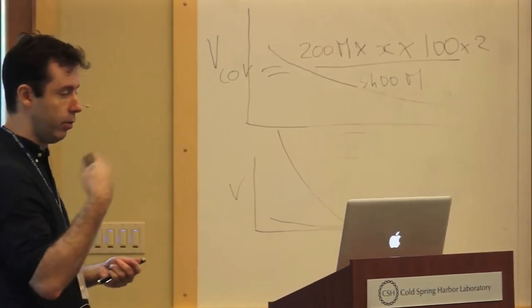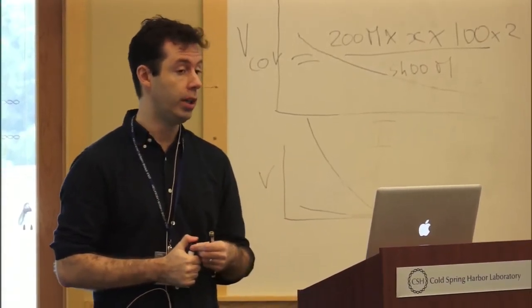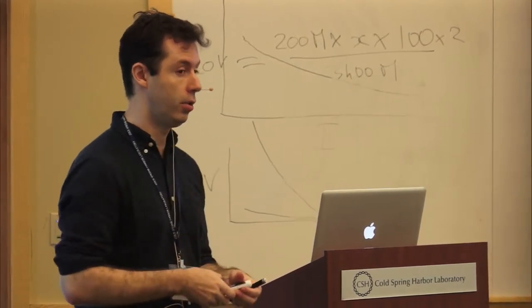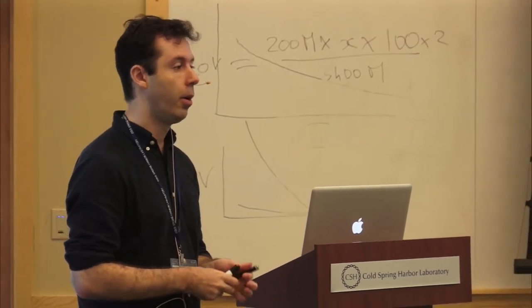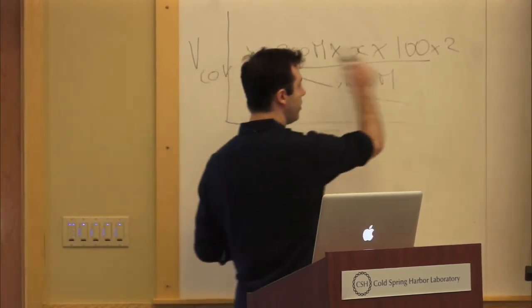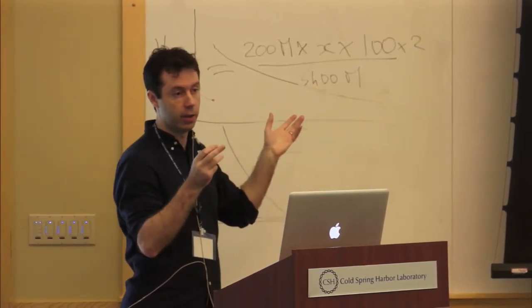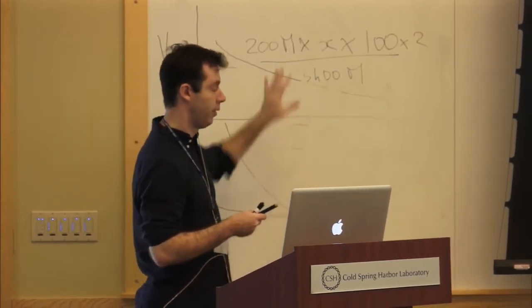You can't use the ones that you removed, and that is also a factor that needs to be taken into account. The number of clonal reads can actually be very high, sometimes 50% of your reads are clonal. So that definitely decreases your estimated coverage. But the bottom line, just keep this in mind, is that coverage is equal to how much you sequenced divided by how much you meant to sequence. If you want to sequence only the exome, let's say 55 megabases of DNA, you would replace this by 55 million. But this is the formula that's used.